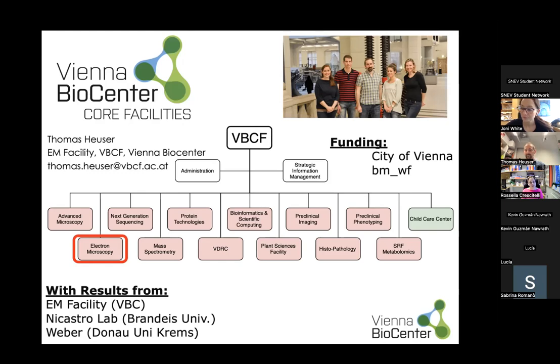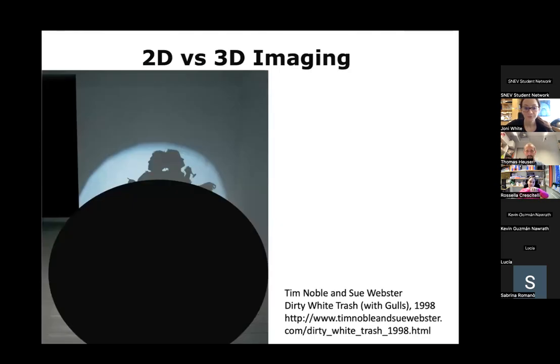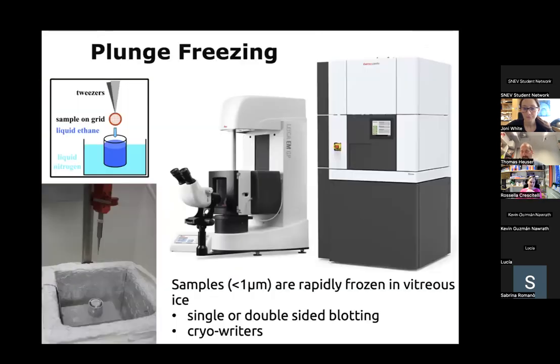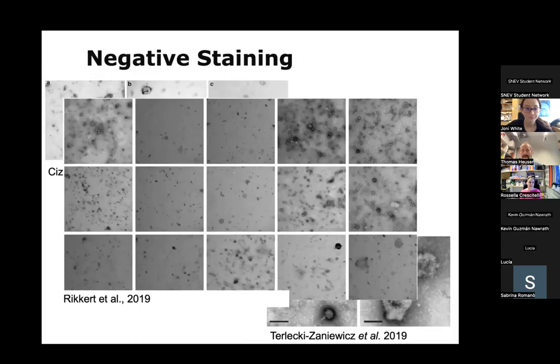Basically, what I do is the opposite. I put the drop of the vesicles on the parafilm, and then I put the grids on. I also try to do the opposite as you do. I saw some difference, but not so many. So my question has been always if the vesicles will be on top of the drop, so it's better to put the grids on, or the other way around. What is your thinking? Yeah, both works.